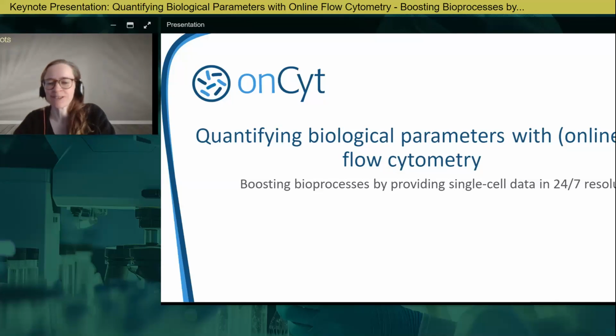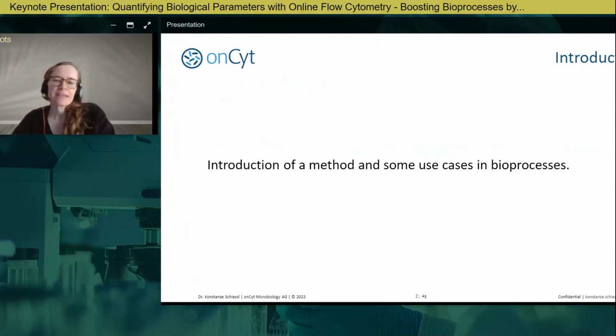I don't know where you're all located, but I appreciate you taking the time. I myself am sitting in Zurich in Switzerland at the moment, and I will tell you about something that I work on every day, and that is online flow cytometry. In the end, this talk will be the introduction of a method and then some use cases of using this method in different types of bioprocesses.